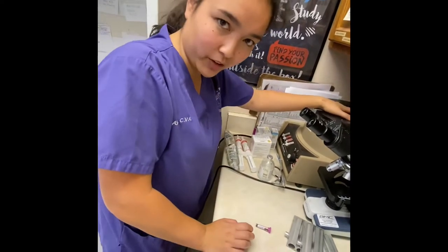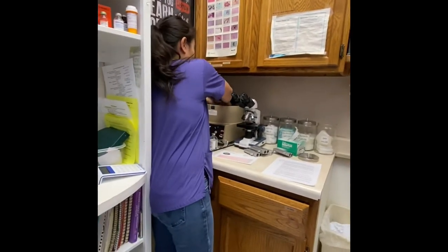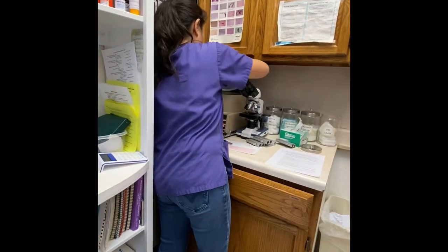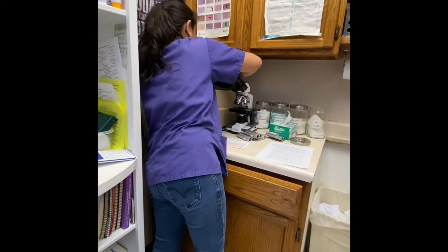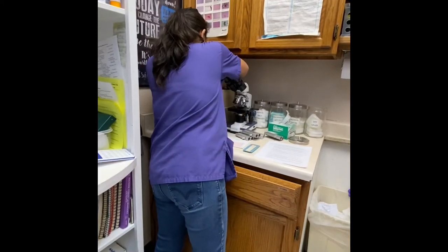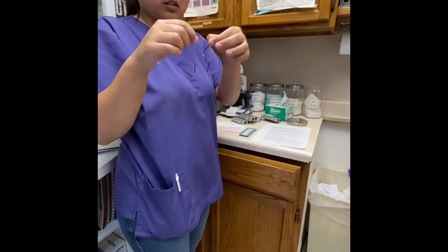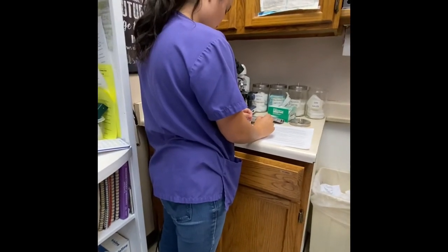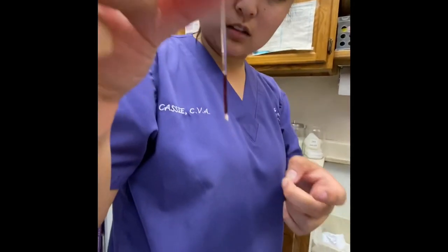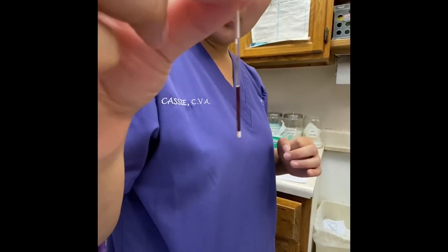We're going to wait for that. The centrifuge has already stopped, so I'm going to go ahead and open it and unscrew the lid. I have my two blood samples. I'm going to go ahead and set both of them down. So first, I'll look at one — it looks like it is good. It's not lipemic or hemolyzed or anything like that, so that looks great.